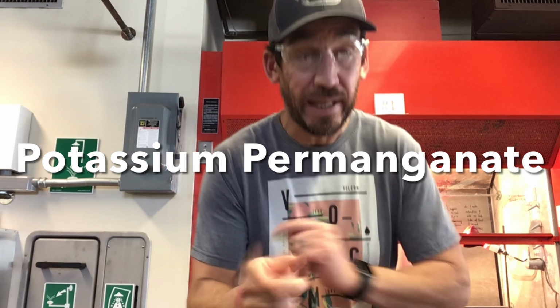Okay, so potassium permanganate to test for unsaturation. First things first, be careful. Don't be scared, but be careful. You have to watch out for false positives, right? Potassium permanganate does react with alcohols and aldehydes and amines, depending on what kind you have. So just keep that in mind. Proceed with caution, but you can use other things to decide if you have those functional groups.